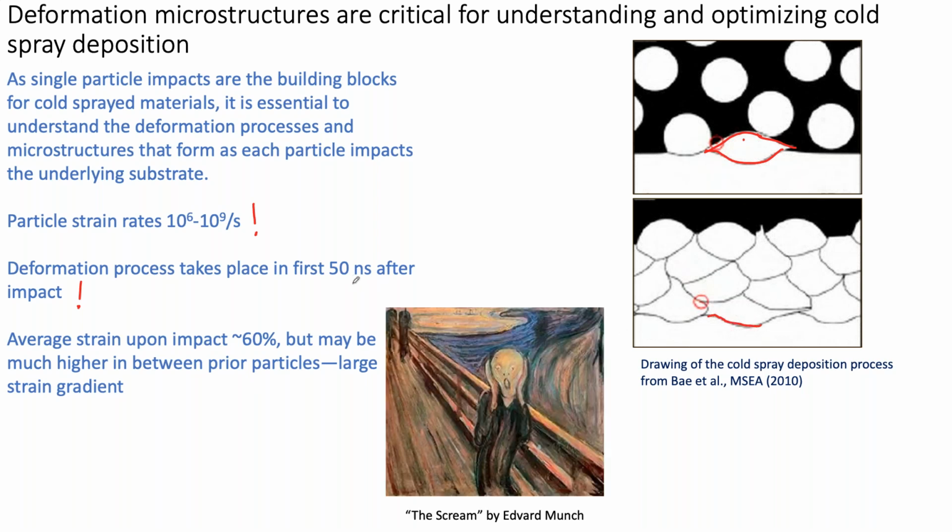So when you consider all that, it kind of reminds me of the famous painting, The Scream by Edvard Munch, right? I mean, wow, that's just kind of incredible. So there's a lot of complex deformation physics and mechanics going on here that really controls this process. And that's really what we're going to talk about today, trying to use microscopy techniques to understand what is taking place between all these impacted particles and during the impact event itself.